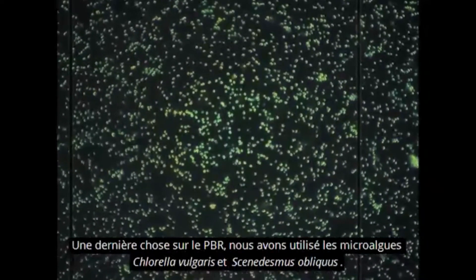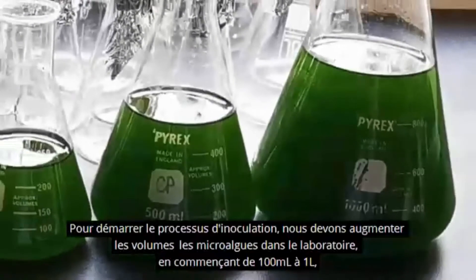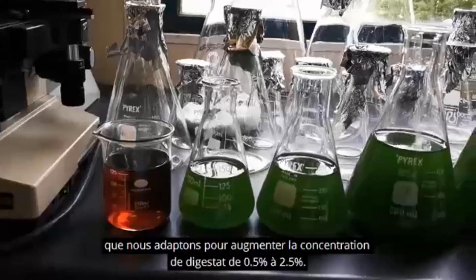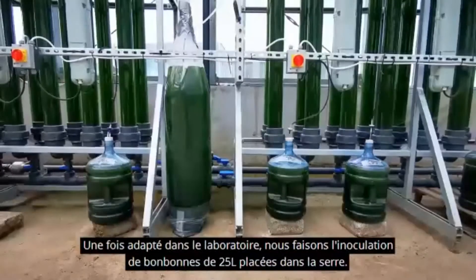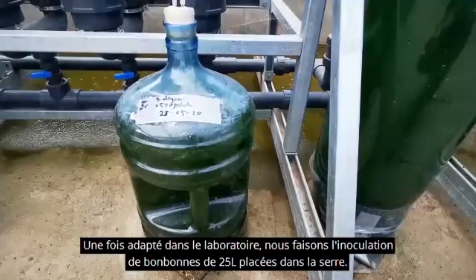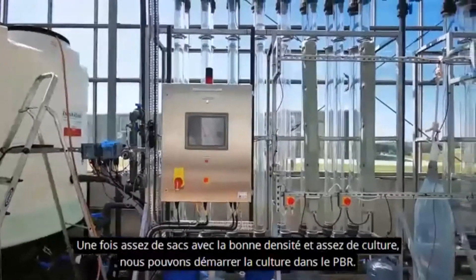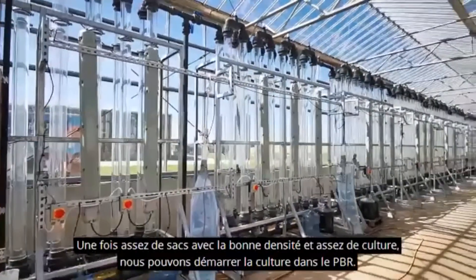We have used the microalgae Chlorella vulgaris and Scenedesmus obliquus. To start with the inoculation process, we must first scale up the microalgae in the laboratory, starting from 100 milliliters to 1 liter, which we adapt to increasing concentration of digestate from 0.5% to 2.5%. Once adapted in the laboratory, we proceed to the inoculation of 25-liter carboys located in the greenhouse. These carboys will be used to inoculate 80-liter bags when the density is enough for scaling up. Finally, when we have enough bags with the right density and liters of culture, we can start growing the culture in the PBR.